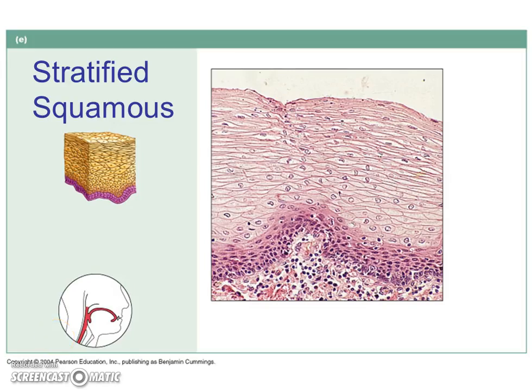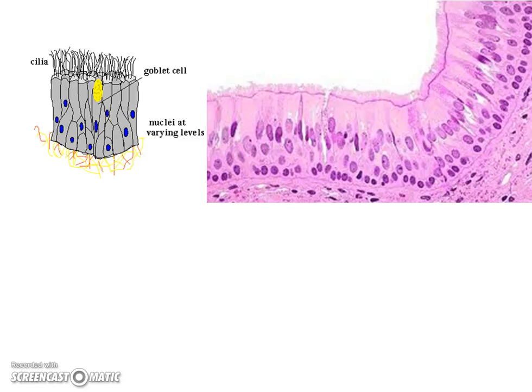Oh, and as far as appearance, I'm not sure what you want to say about it. To me, it looks like skin because I know what skin looks like, but you just put your own description down there. So let's move to the next one.